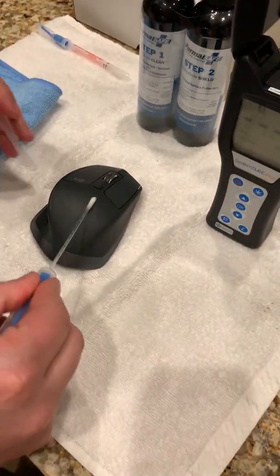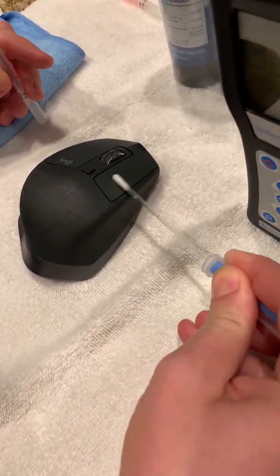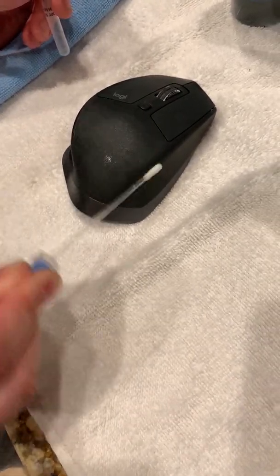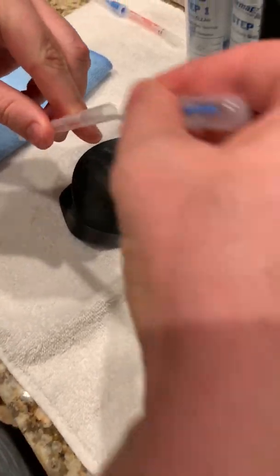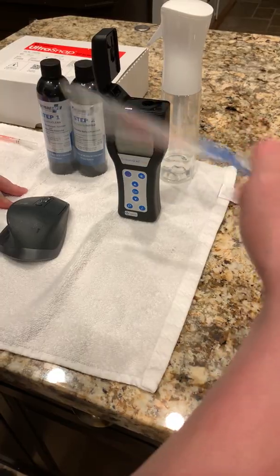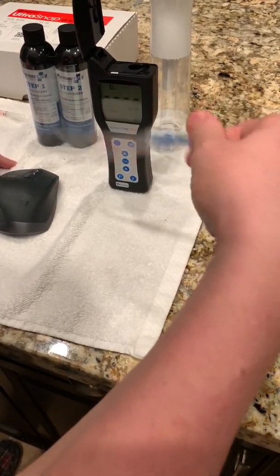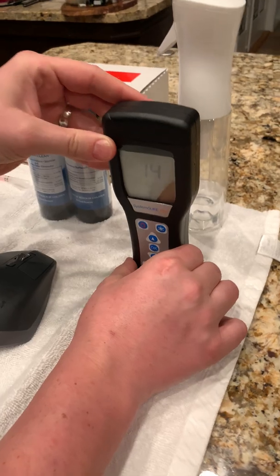I'm going to do the exact same thing. I'm going to take my crosshatch — back and forth and up and down — twisting it while I'm doing it. I'm going to put it back in the tube. Same as before, I'm going to break the blue tab on top and drop the luciferous fluid into the tube. I'm going to shake this for 10 seconds, then drop the sample into the slot again, close the lid, press OK, and make sure it stays completely vertical.